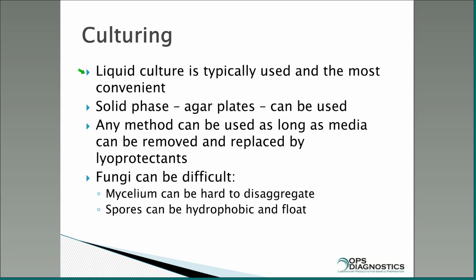Sometimes that doesn't work so well. You can use solid phase, so you can grow cells on an agar plate, and then you can put reagent 18 or microbial freeze drying buffer on the plate and flush off the cells, and just drop the medium and then freeze dry that way. It doesn't really matter what you do, but what you want to do is get rid of the growth medium and replace it with the lyoprotectant. Now, the exception to this is that anybody working with fungi will know that they don't like to cooperate.